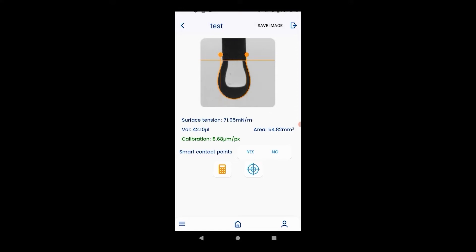Now we will demonstrate how to use multi-capture for dynamic surface tension measurement. The app's multi-capture function can be used to take multiple images in a set time frame.